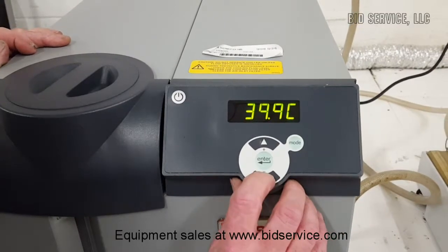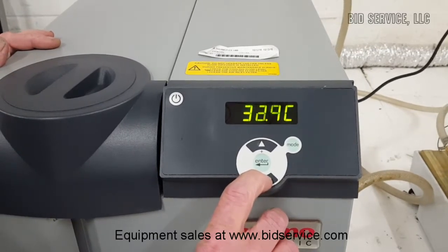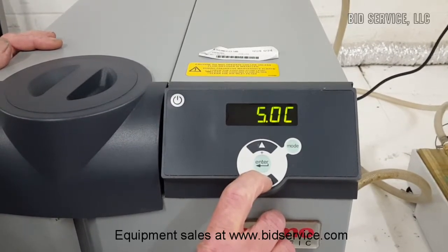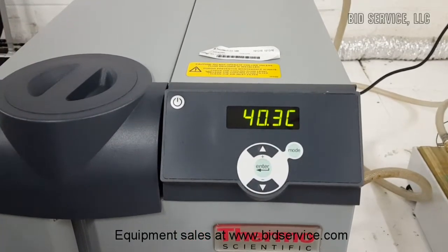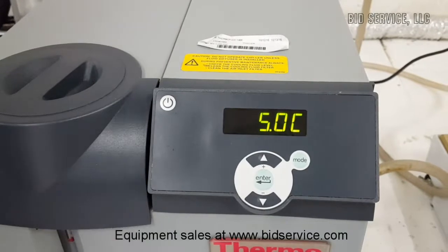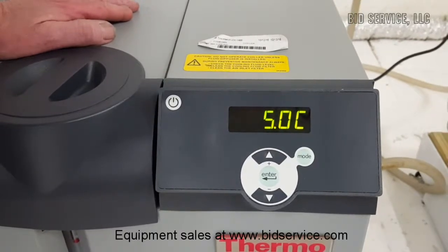Now we'll change the set point down to its minimum, which is 5 degrees C, and we'll come back in a little bit and see how it does. We're now down to plus 5 degrees C, which is the minimum temperature for this unit.